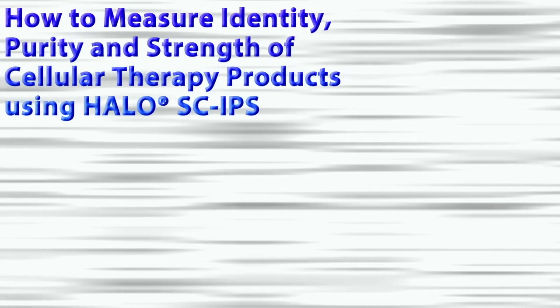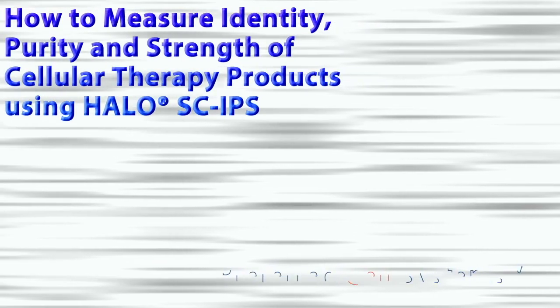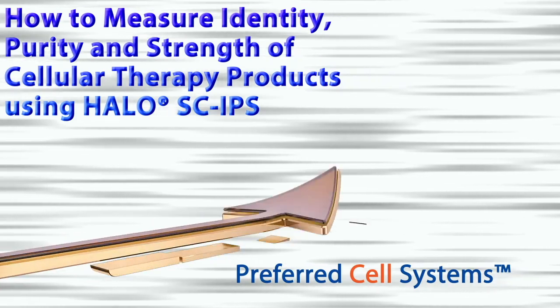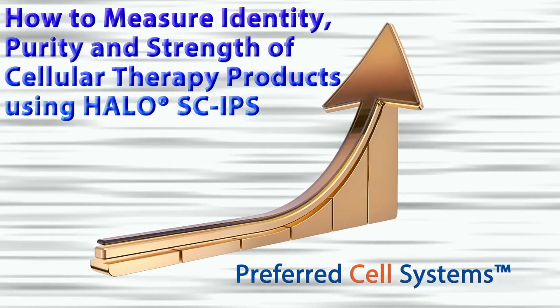Welcome to this tutorial that describes how the Halo SC-IPS kit from Preferred Cell Systems is used to measure the identity, purity and strength or potency of cord blood, bone marrow or mobilized peripheral blood products used for hematopoietic cellular therapy.